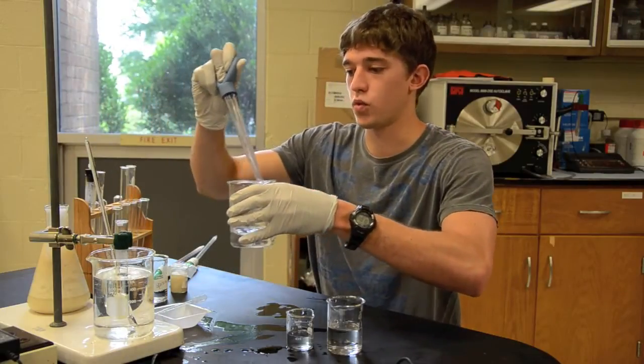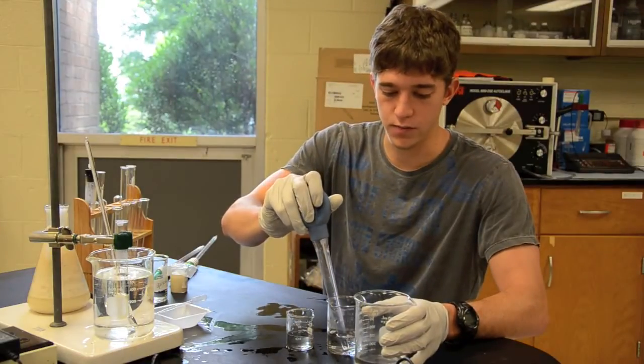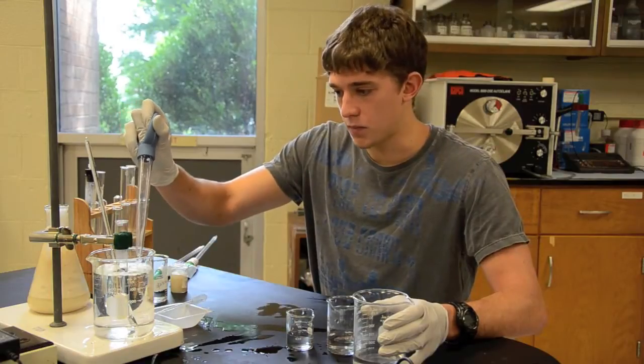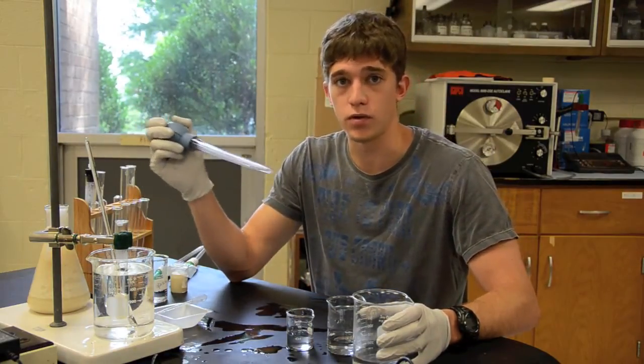As your experiment goes on, the temperature will drop below 40 naturally. So I'm going to take some of this hot water from this beaker and add it. The temperature rises back up to 40, and that's how you keep the temperature just by doing that.